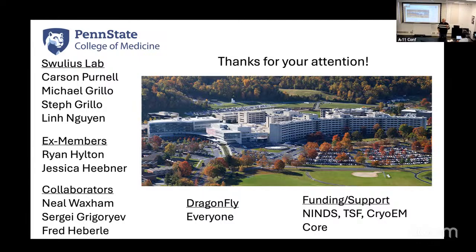I can give one use case. A colleague of mine, who you may know, I shouldn't say who it is, I don't know if this data is public, was using our networks and told us that in thick bacterial samples, our networks definitely outperformed others in generating denoised cytoplasm, from which they could pick ribosomes and other things that were not working with other pipelines. So in really dense, especially bacterial situations, it seems to be working better than others. But for the segmentation, I'm still working on that.